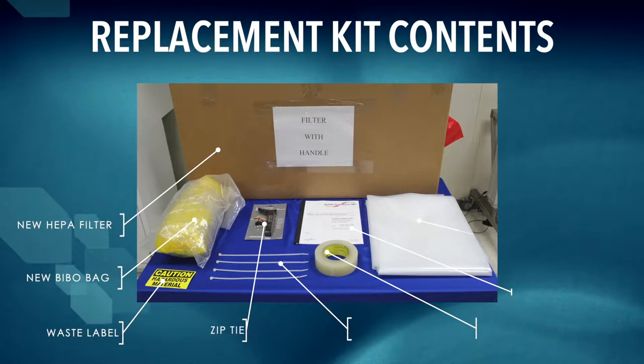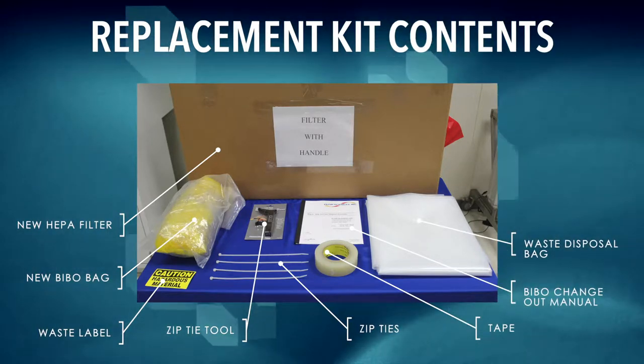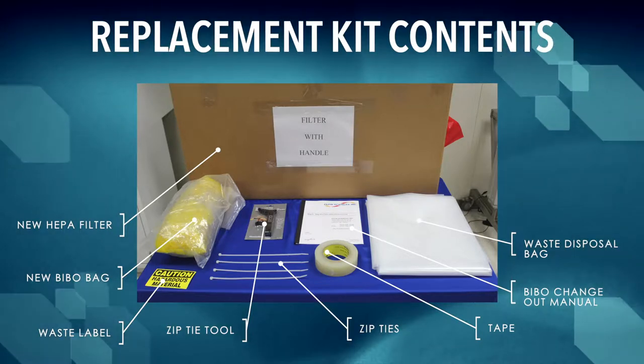Replacement kit contents include: new HEPA filter, new BIBO bag, waste label, zip tie tool, zip ties, tape, BIBO change out manual, and waste disposal bag.